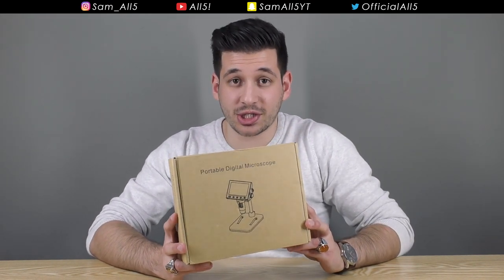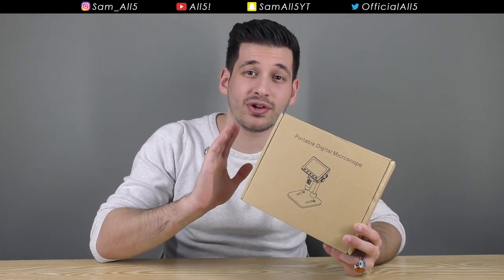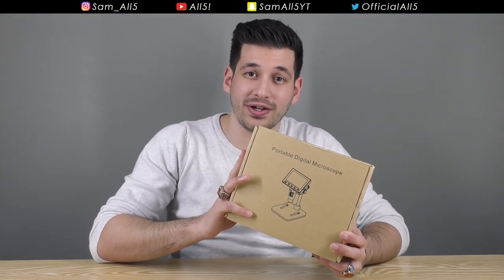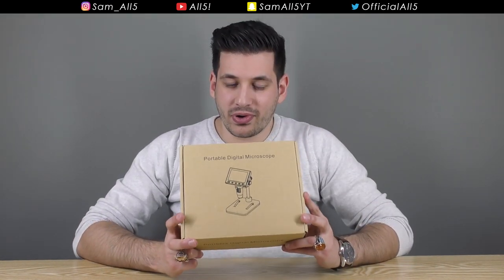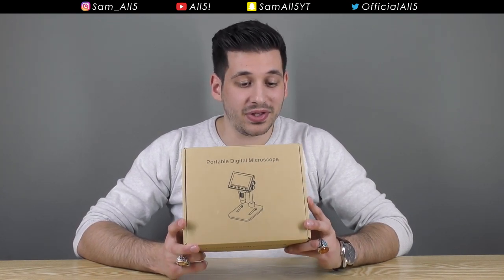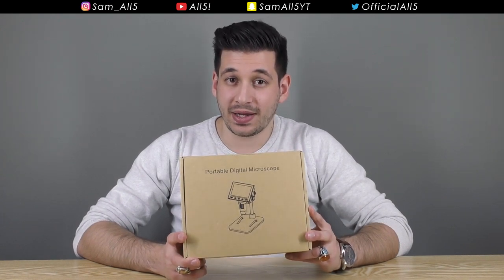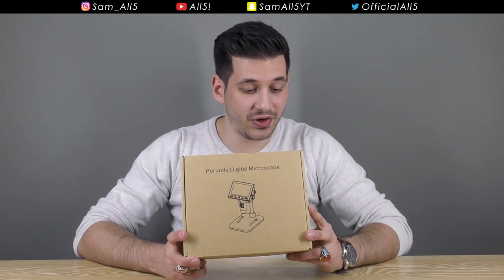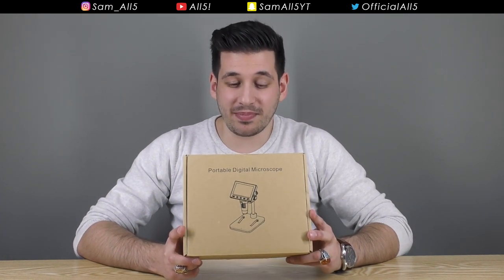This one is a digital microscope, so it's not just one you can look into — it can actually record photos and videos. It even has a screen, so I'm pretty excited to check this out. Price-wise, you wouldn't believe this, but this thing cost me 33 pounds including shipping. That's about 43 dollars — really damn cheap.